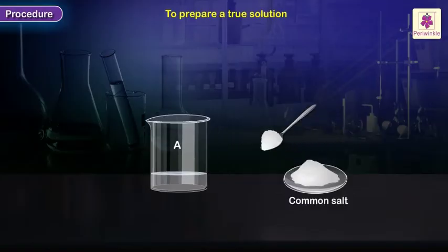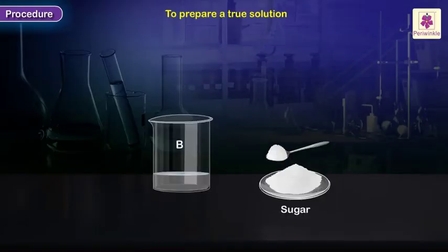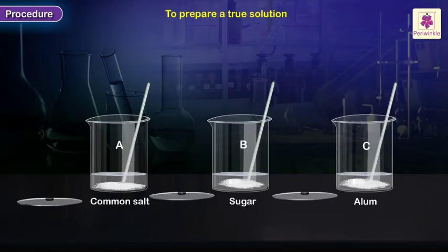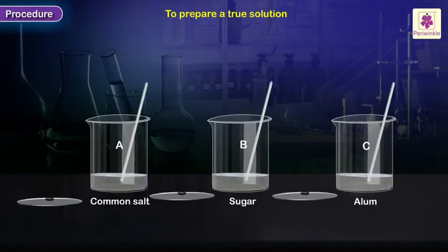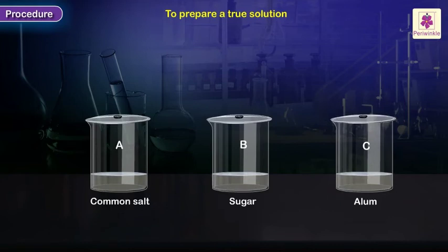Add a spoonful of finely powdered common salt in beaker A, finely powdered sugar in beaker B, and finely powdered alum in beaker C. Gently stir the three mixtures with clean glass rods. Cover the beakers with glass or plastic lids.